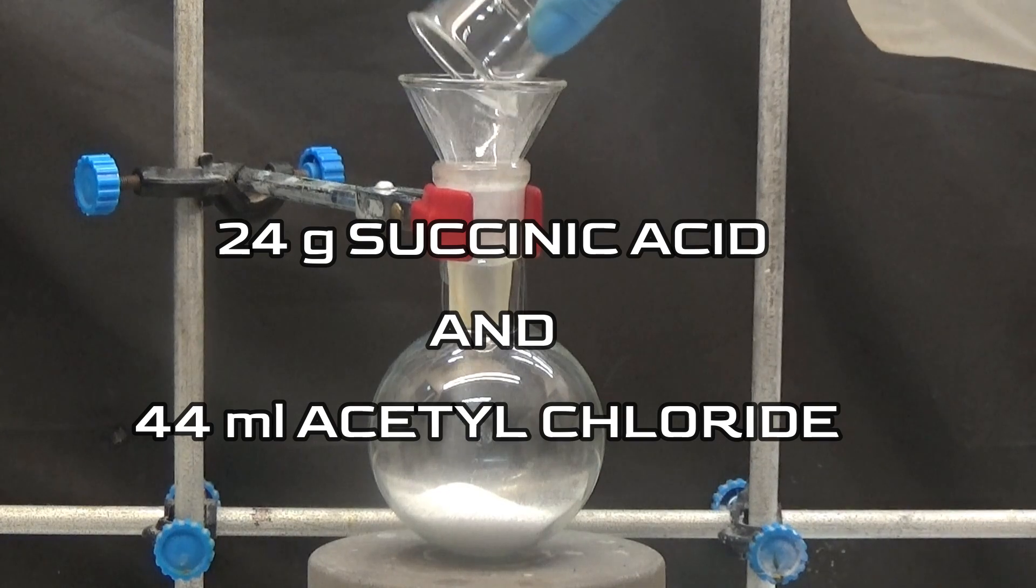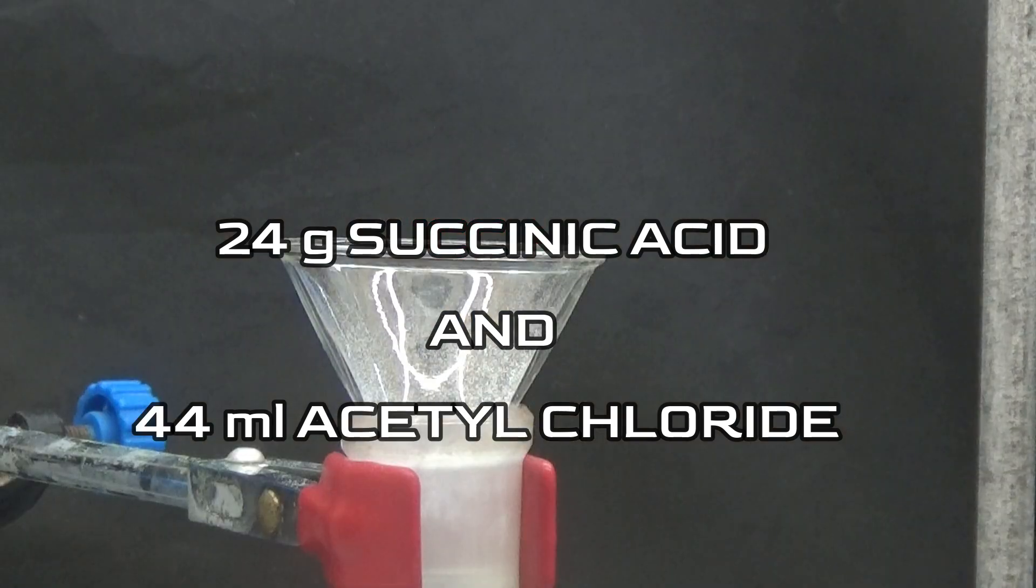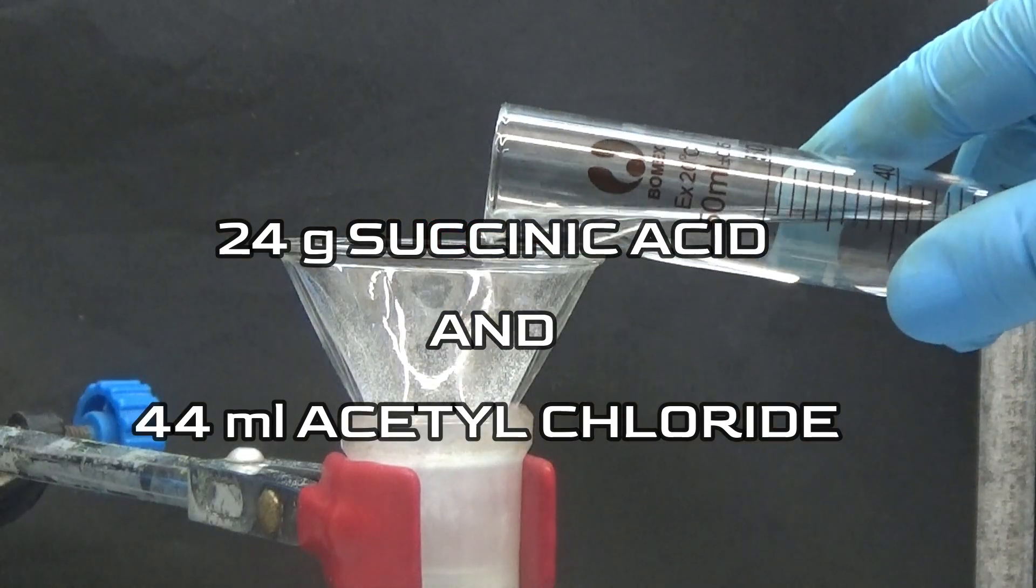In a 250 milliliter flask, add 24 grams of succinic acid and 44 milliliters of acetyl chloride.